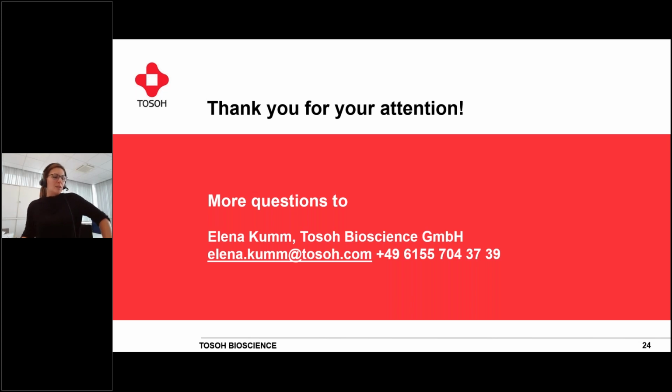For ACC, it might be that you're losing some resolution if you're using a not quite suitable buffer for the method, but one better suited for MS. But if somebody has a specific point or question, they can also contact us and ask if we have recommendations for that, because we're always happy to support, and I can tell you there are people using all these things.